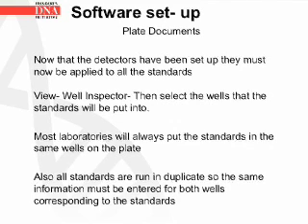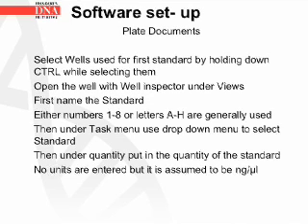Now that the detectors have been set up, they must be applied to all the standards. Under View, go to Well Inspector. Then select the wells that the standards will be put into. Most laboratories will always put the standards in the same wells on the plate. Also, all standards are run in duplicate, so the same information must be entered for both wells corresponding to the standards. For setting up the standard wells, select the wells used for the first standard by holding down the Control key while selecting them. Open the wells with the Well Inspector under View.